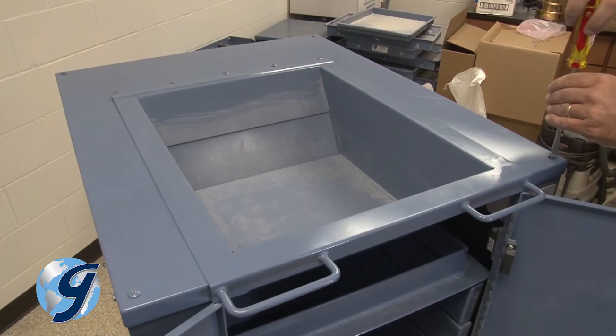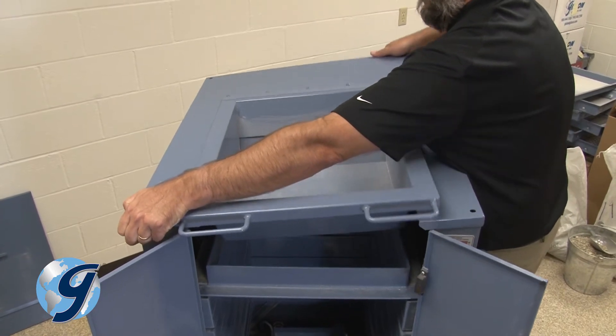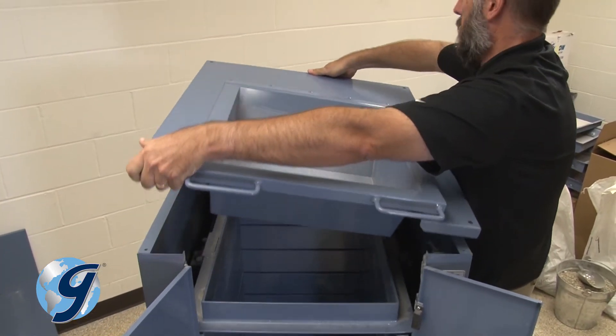Remove the four screws at the corner of the top panel, lift the top panel and hopper assembly off the unit, and then carefully set it aside.